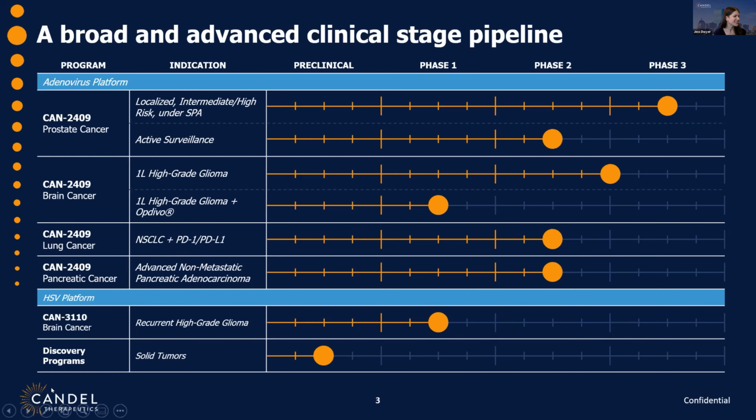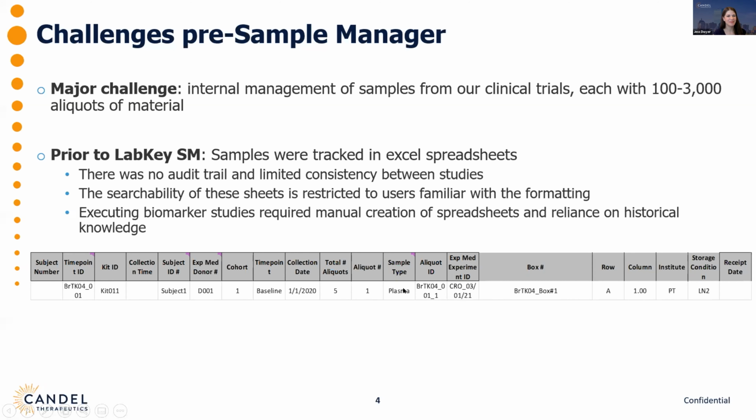So that's where Sample Manager comes in. We're managing all of these samples from all of those trials internally and had so far been using Excel spreadsheets for sample tracking. So when I joined the company in April, I started curating and improving the spreadsheets, knowing that eventually I'd import them into some kind of software.